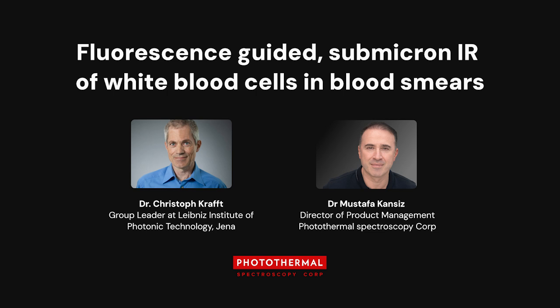I've been doing these webinars for a long time, but this one is especially exciting for me because it brings together so many key and enabling capabilities. Today we'll really be talking about fluorescence guided submicron IR of white blood cells in blood smears on glass slides. A few key words there: we're doing fluorescence guided. We're looking at specific types of cells in blood smears, and it's on glass slides. So I'm going to be stressing the glass component a fair bit throughout this talk.